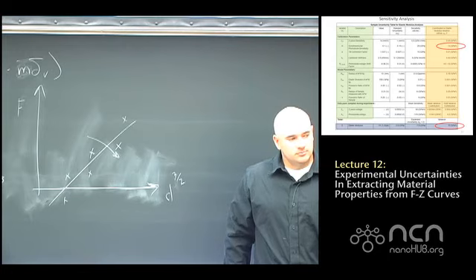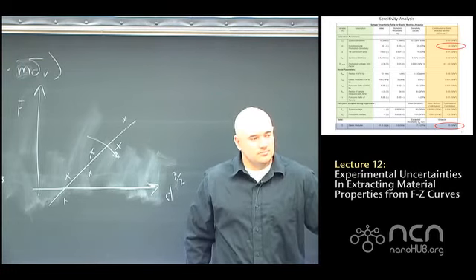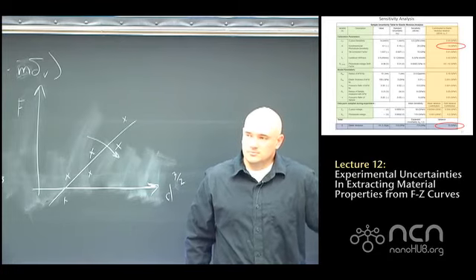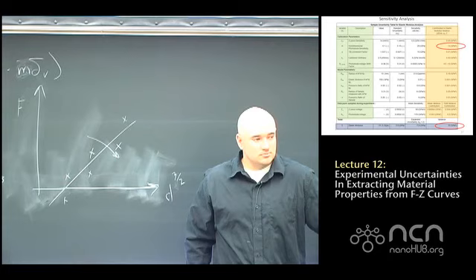Z is in tens of nanometers, and delta can be tens of nanometers. So you're subtracting two rather large quantities, and you're trying to get an indentation which in this case may be 1 nanometer at most, or half a nanometer. So the uncertainty comes primarily from that, because if you haven't done your volts to nanometer conversion accurately, it feeds all this uncertainty into your final answer for the elastic modulus.